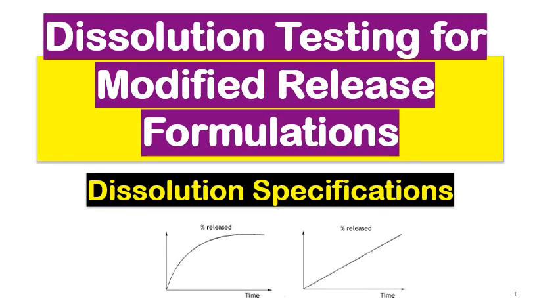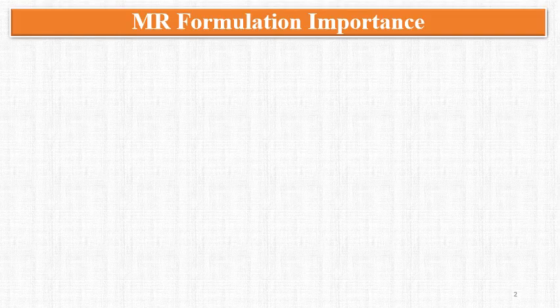Hello and welcome dear students, professionals and learners to the interesting topic on dissolution testing for modified release formulations. These are also known as MR formulations and these have specific dissolution requirements and specifications. So let's start with the video.